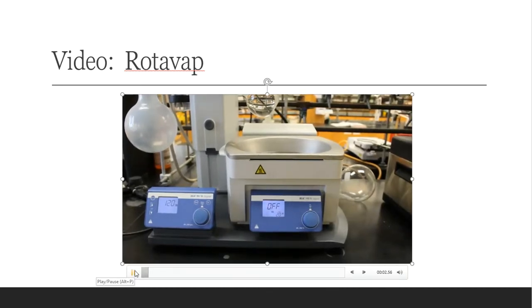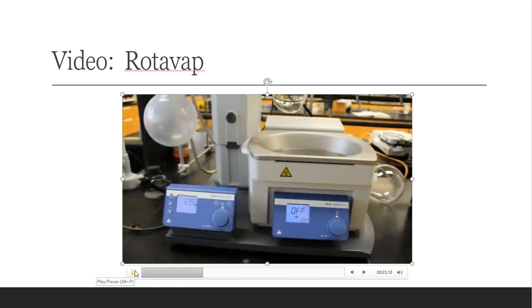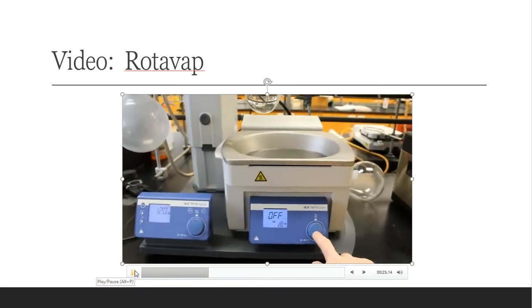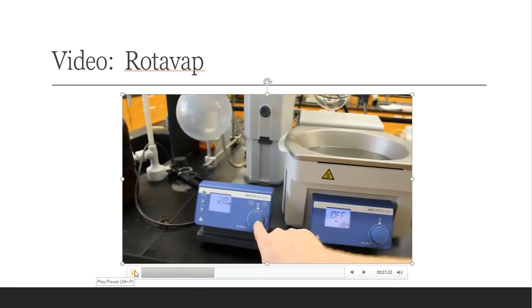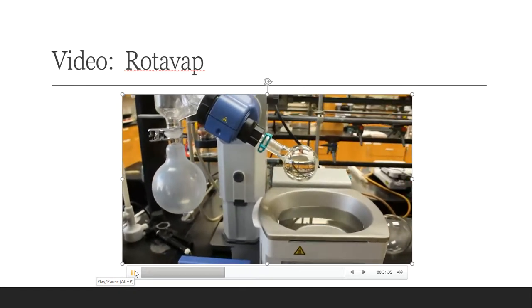Folks, this is something that we call a rotary evaporator, or a rotovap. So let me touch base on the pieces and parts that make this thing work. Right here we have a water bath, and this water bath can either be filled with water, of course, or we can also use oils. If the boiling point is at a really hot temperature, we can choose to put an oil in there instead of water. The controls to set the temperature of the water bath are here. The control to set how fast this thing will spin is over to the left.